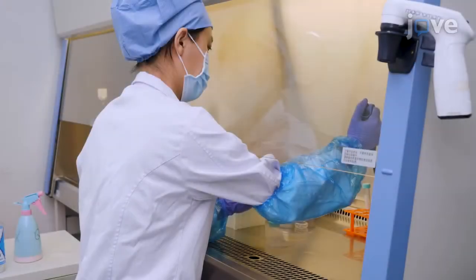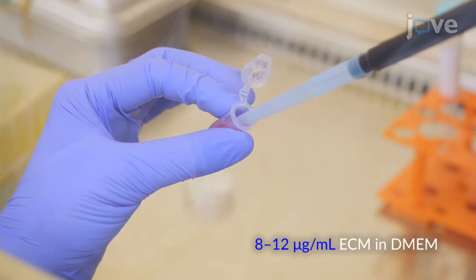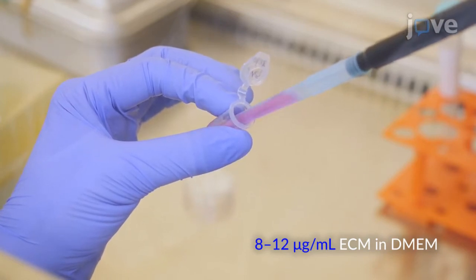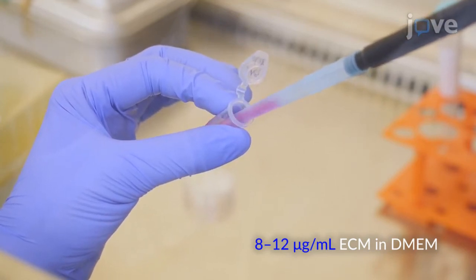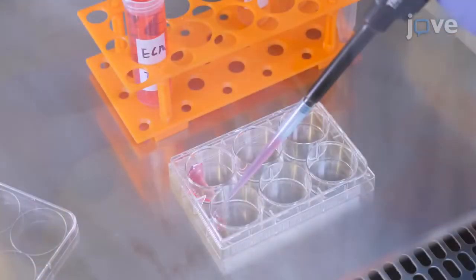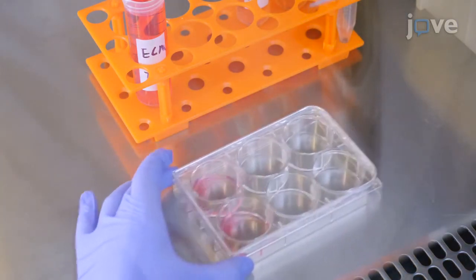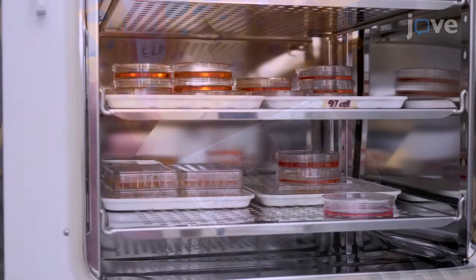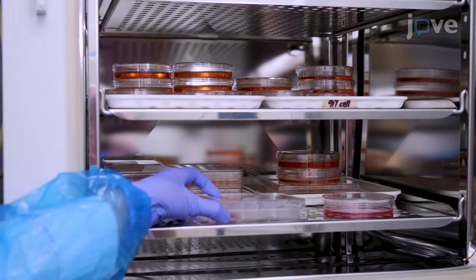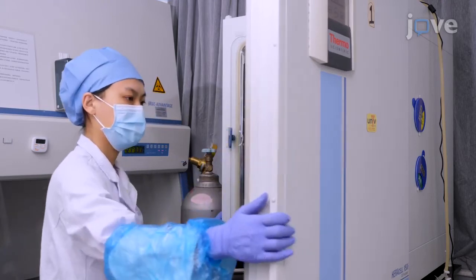Begin by preparing 50 ml of ECM solution by adding 1 ml of the thawed 50x stock solution to 50 ml of DMEM. Then add 1 ml of this prepared ECM solution to each well of a 6-well plate and incubate it for 1 hour at 37 degrees Celsius and 5% carbon dioxide.